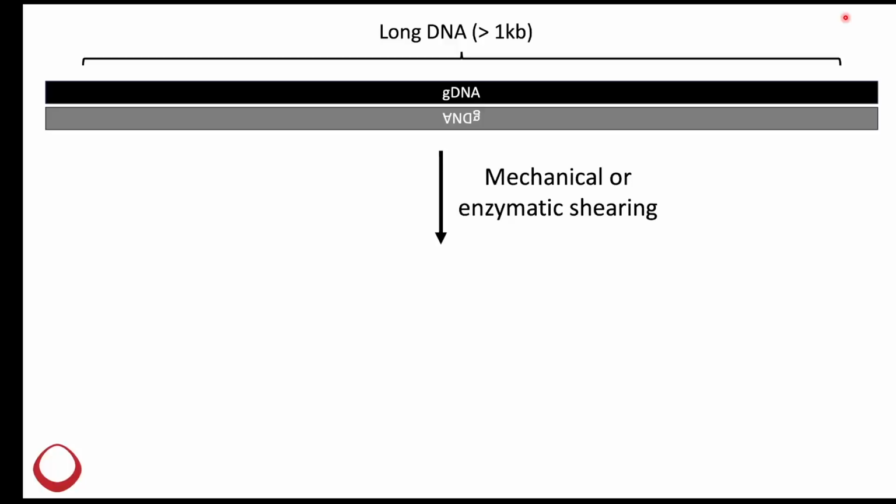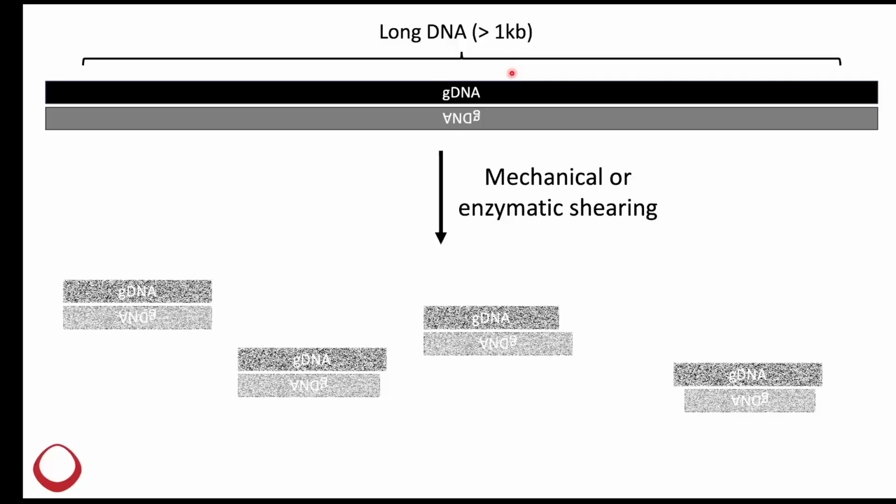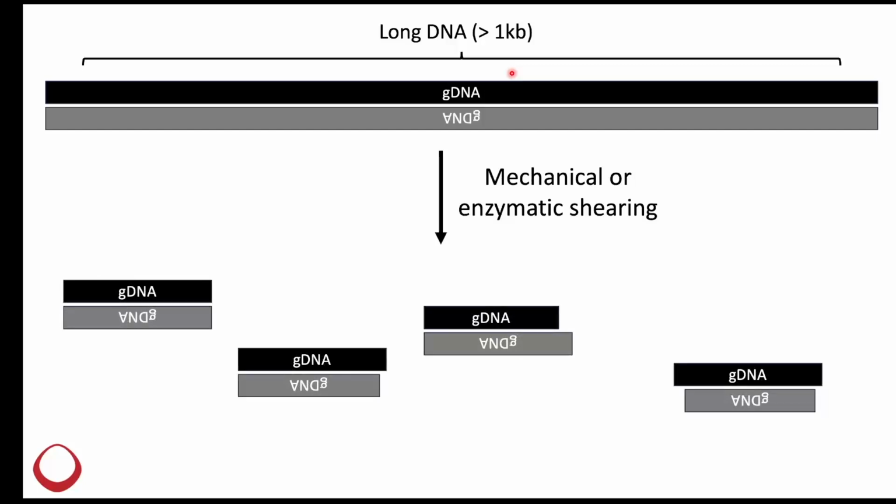When we work with genomic DNA, we usually start with these long intact molecules, and we mechanically or enzymatically shear them. And so this process tends to produce relatively clean ends. They're mostly blunt with very short overhangs, as I'm detailing here. And so that's what you see with long DNA, whether it be genomic DNA or DNA derived from somewhat degraded samples such as FFPE DNA.